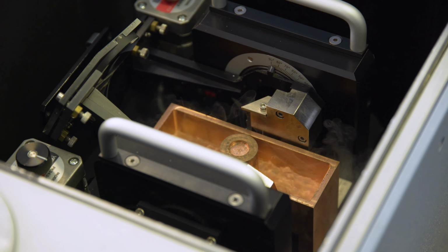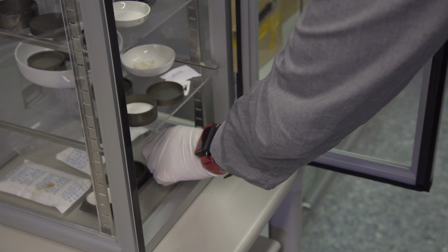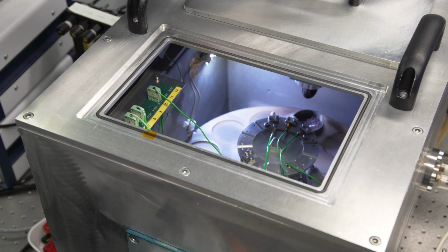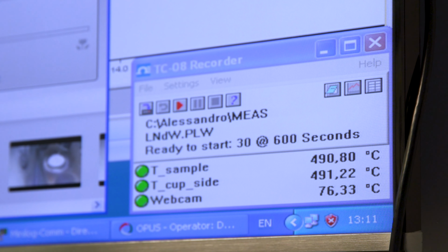When we started working on BepiColombo, we decided that to actually understand the science of Mercury, we need to have laboratory data taken at the same extreme temperature that we get on Mercury. So our facilities can replicate the temperature of 450 degrees C that we get on Mercury, and we can even go well beyond that, up to 600-700 degrees Celsius if necessary. And so far we're the only facility in the world that actually can take spectra at that range.